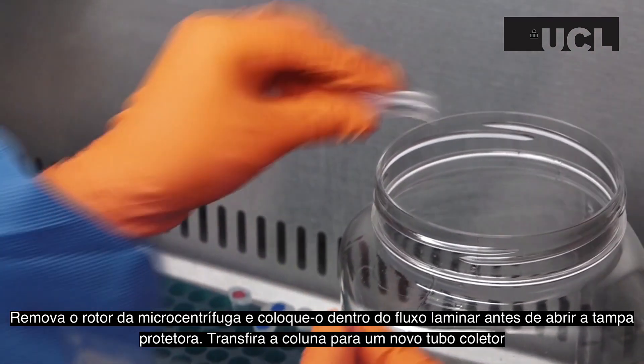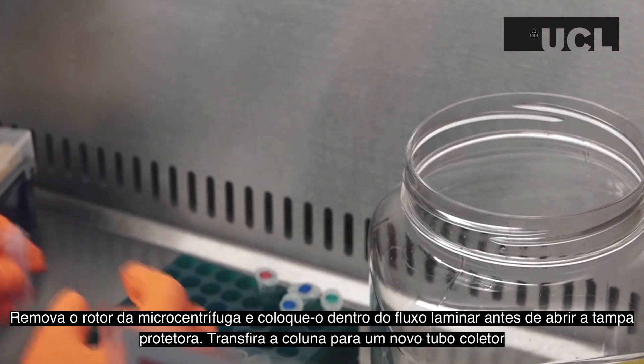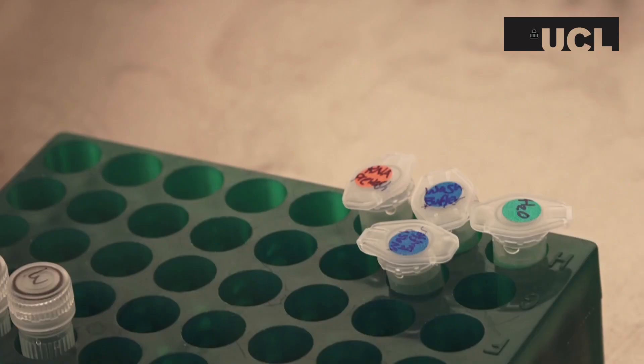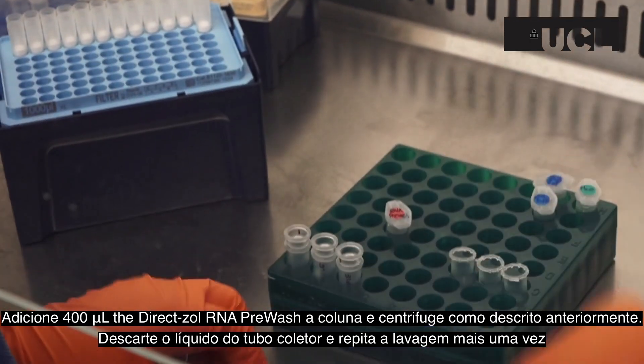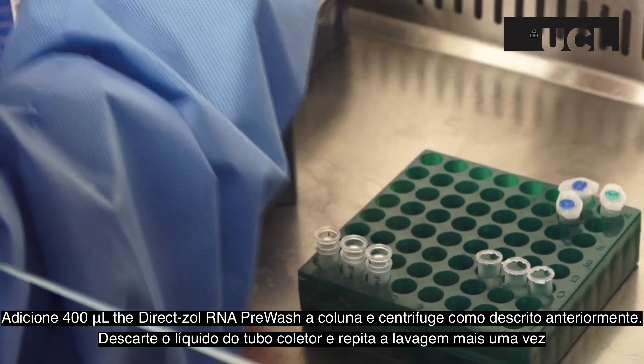Remove the bucket from the microcentrifuge and place back into the microbiological safety cabinet before opening the bucket. Transfer the column into a new collection tube. Add 400 µl of DirectSol RNA pre-wash to the column and centrifuge as described before.